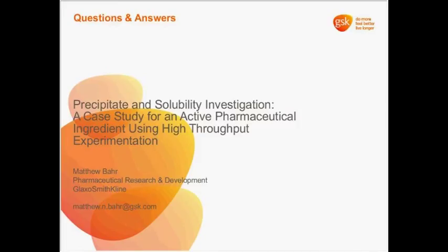So yeah, you really just have to weigh how much time you have to run the experiment, and how much error you can have in your time point data collection points. Okay, fantastic. A very thorough answer there.